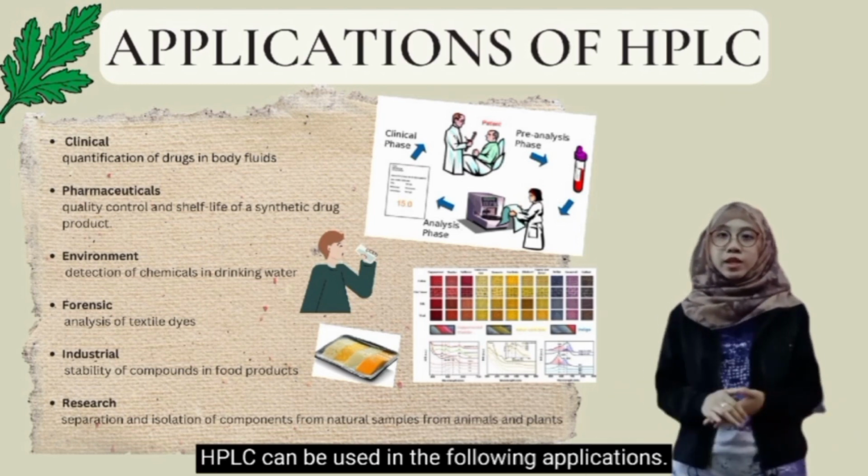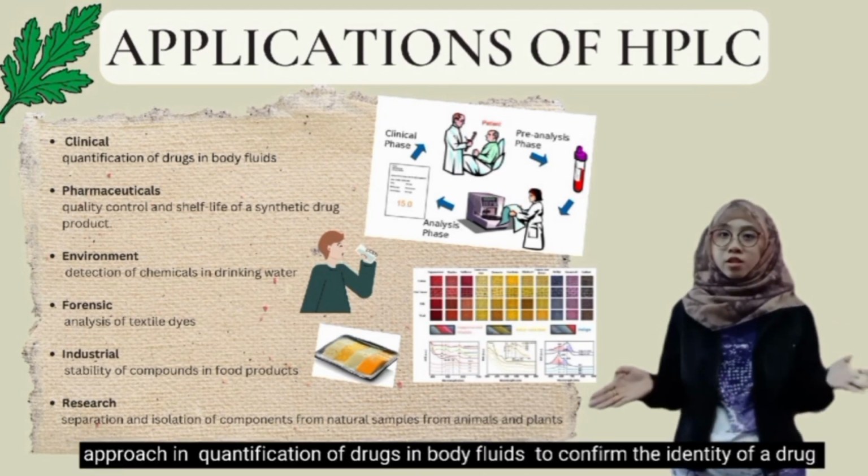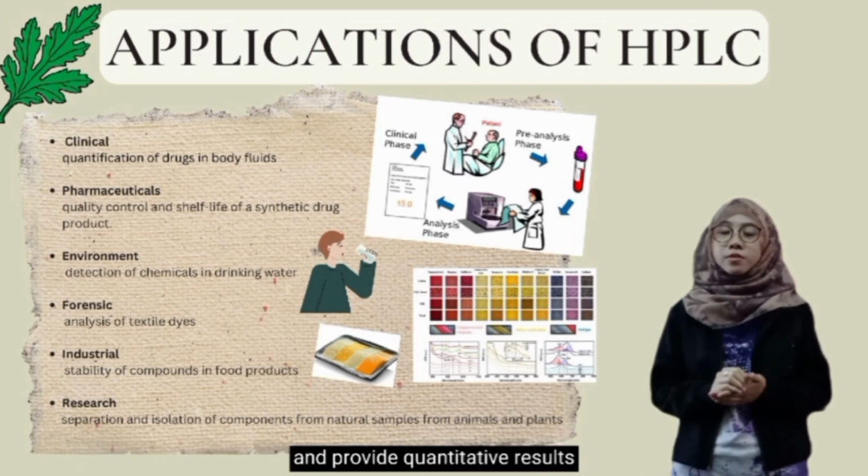Next, I will present the applications of HPLC that are most widely applied. HPLC can be used in the following applications. In the clinical field, HPLC provides a convenient and fast analytical approach in quantification of drugs in body fluids to confirm the identity of a drug and provide quantitative results.